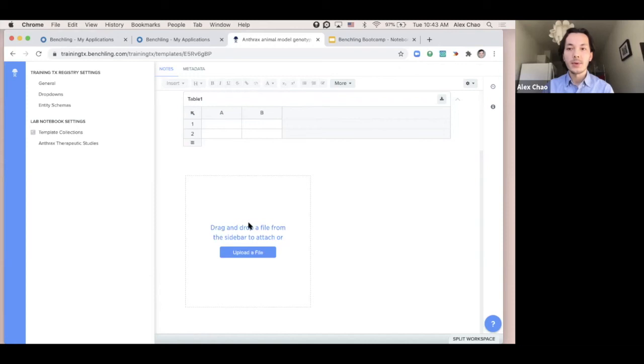So for our second poll, we're wondering, how could your teams utilize entry templates? So please do take some time to fill this out. Awesome, so it looks like everyone is filling out this Zoom poll. So I'll go ahead and end the poll. And I'll share the results.